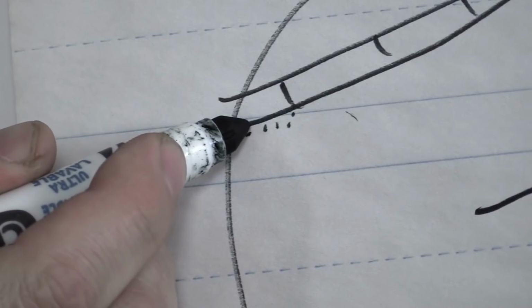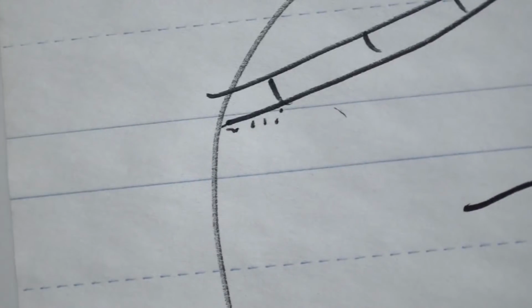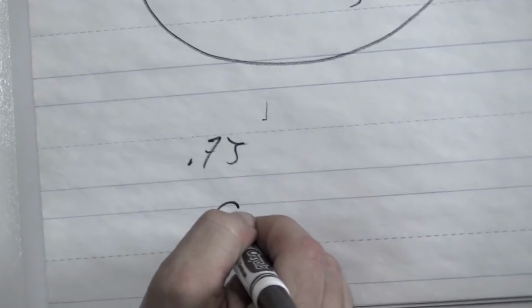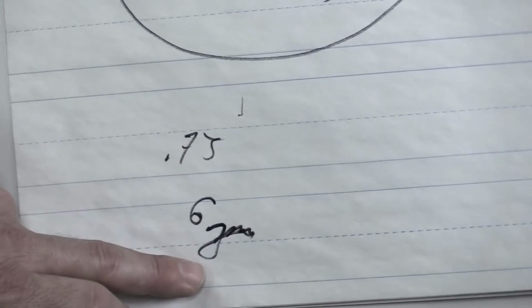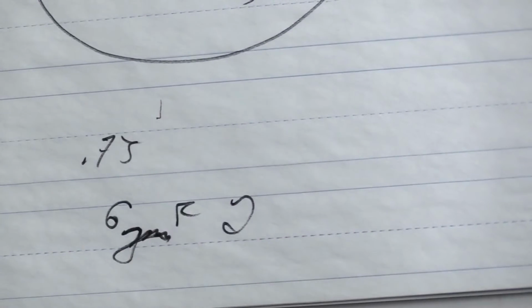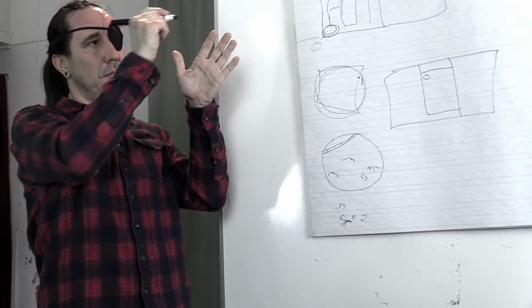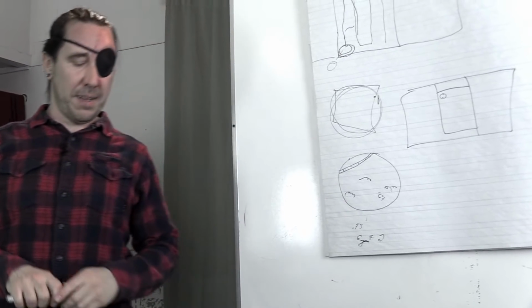I would say that that's going to be 6 to 7 of those little dots wide. So let's call it 6 micrometers wide. Then I would note 6 and the abbreviation for micrometers. So I've got the length and that, and then I would also note that I had 2 flagellates. I usually just write this out in a notebook where I've got a grid of flagellate, view 1, view 3, view 4, none, whatever like that.